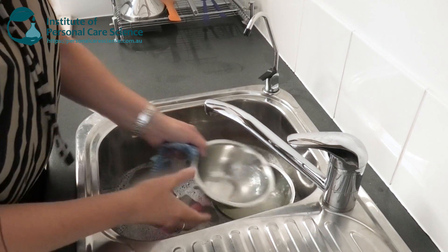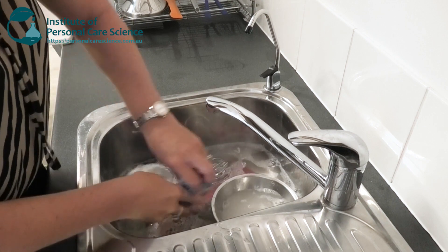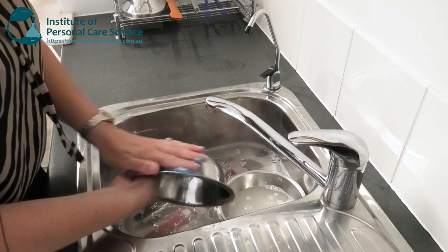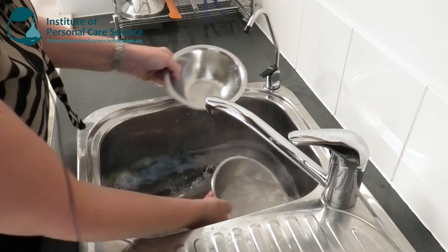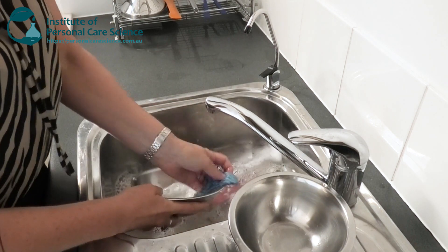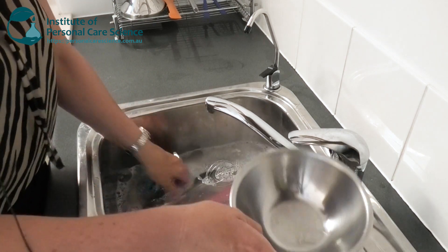Next we come to the washing step. In this step, we wash everything really thoroughly — all surfaces — in hot, soapy water. This can just be a regular detergent. The most important thing here is that you are cleaning all surfaces really thoroughly.